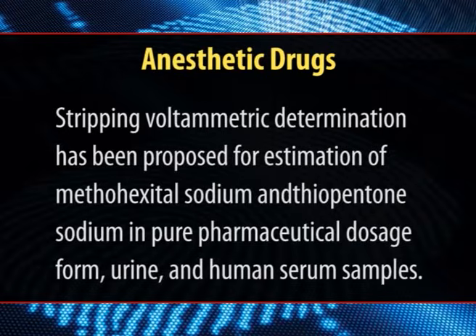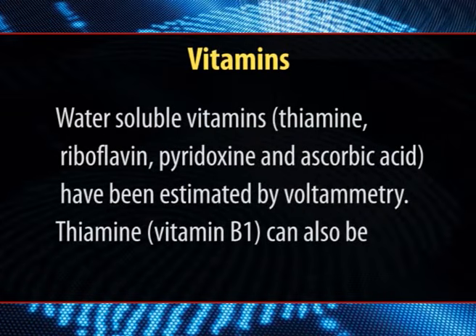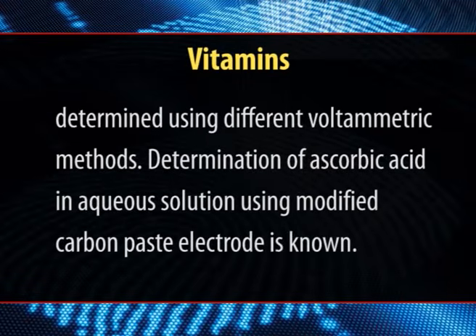Stripping voltammetry determination has been proposed for estimation of methohexital sodium in pure pharmaceutical dosage form, urine and human serum samples. Similarly, water soluble vitamins have been estimated by voltammetry. Thiamine, which is vitamin B1, can also be determined using different voltammetric methods.